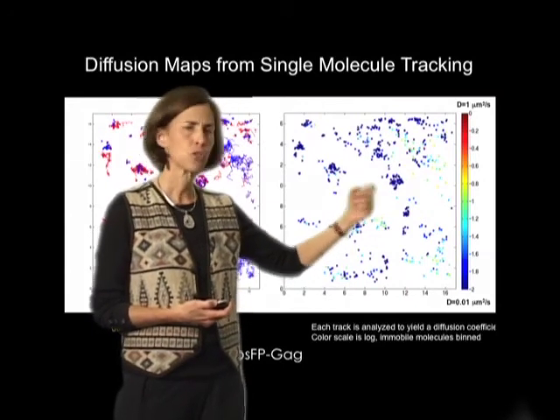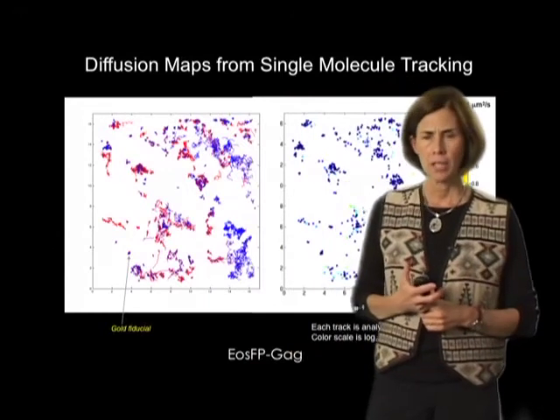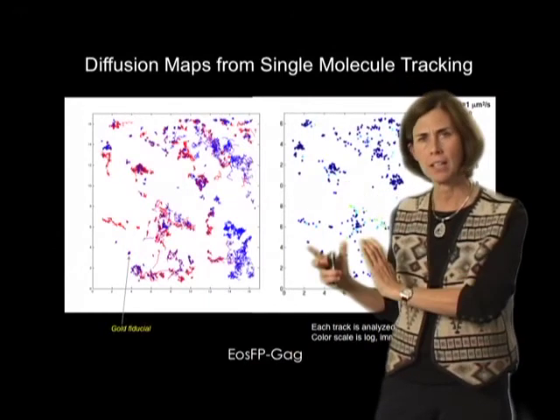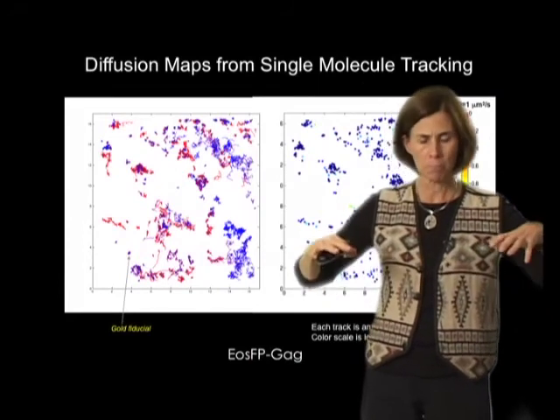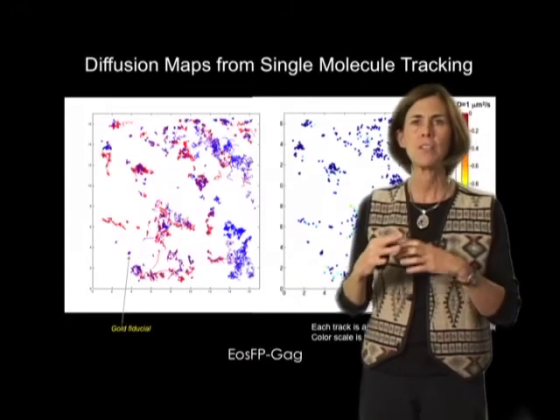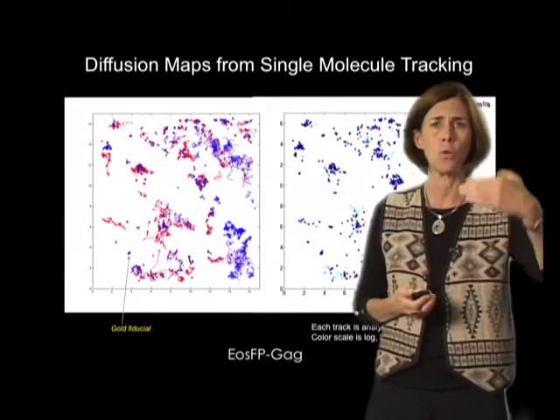We think these clusters represent sites of viral budding on the surface of the cell, and we're hoping that using this technique, we can get insight into how the virus budding process occurs vis-a-vis the assembly of these proteins that form the coat of this virus.